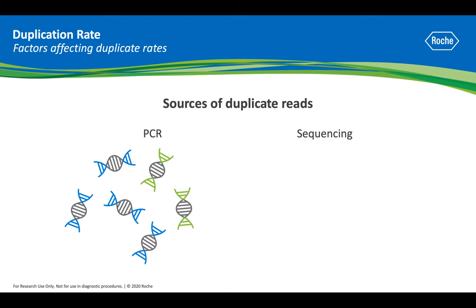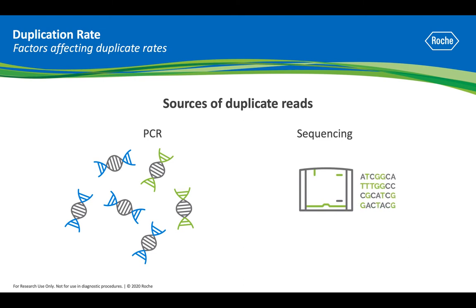Sequencing can also produce duplicate reads, where the same template library is used for cluster generation resulting in identical sequencing clusters producing sequencing reads with the same 5' and 3' ends. This is often observed on sequencers using patterned flow cells.